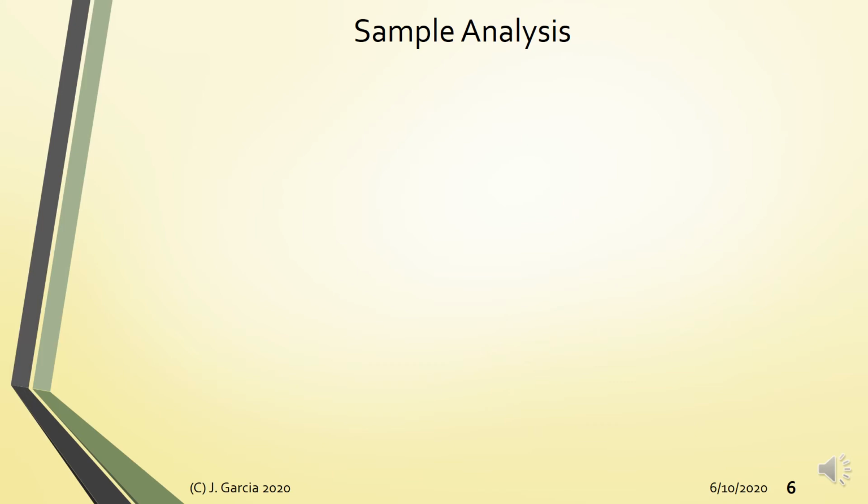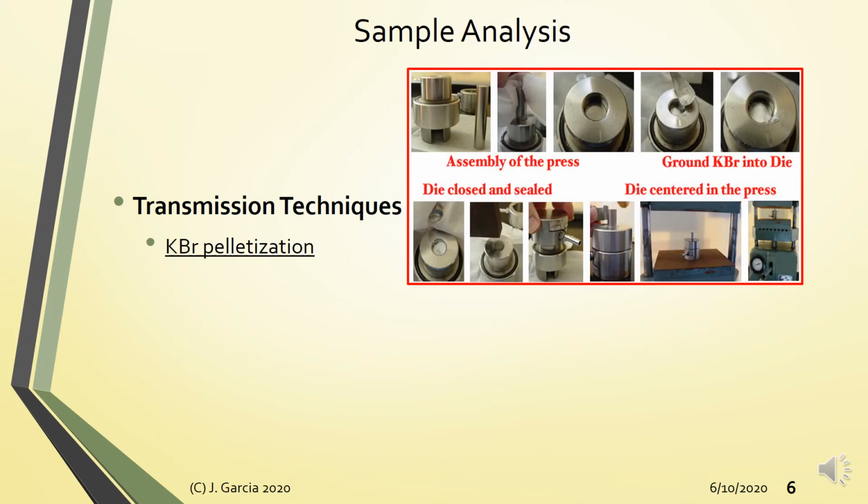But basically, transmittance measurements yung pinaka gold standard ba, in IR spectroscopy. Alright? Kasi yung transmittance measurements, ito yung mayroong direct relationship with absorbance. So if importante sa iyo yung quantitative measurements, okay, then you have to use transmittance or transmission techniques. All right, so yung una na transmission techniques would be your KBr pelletization.